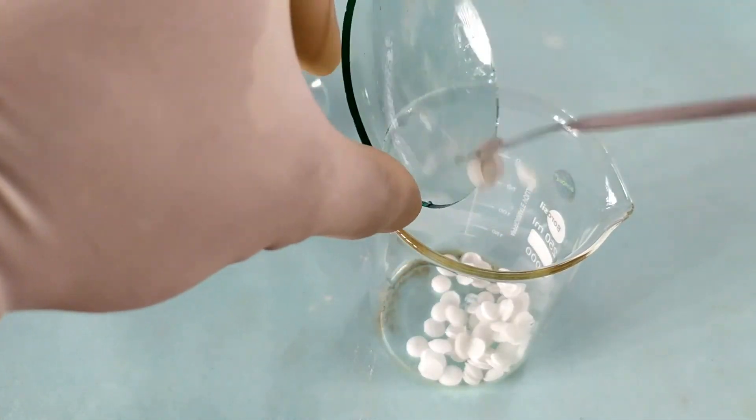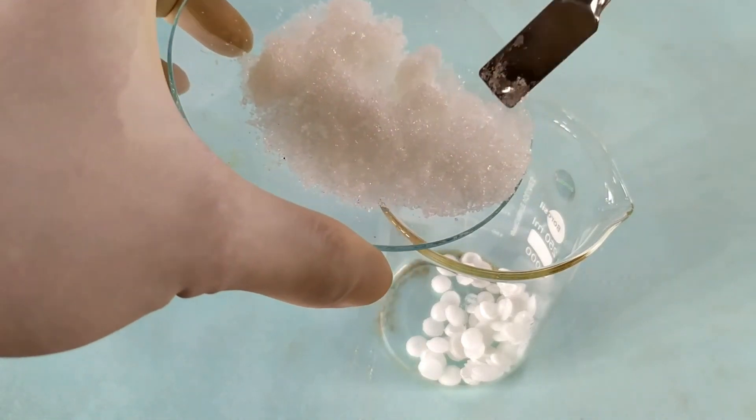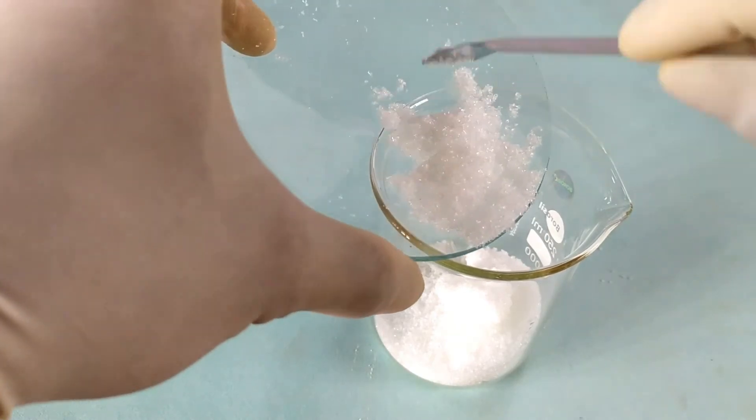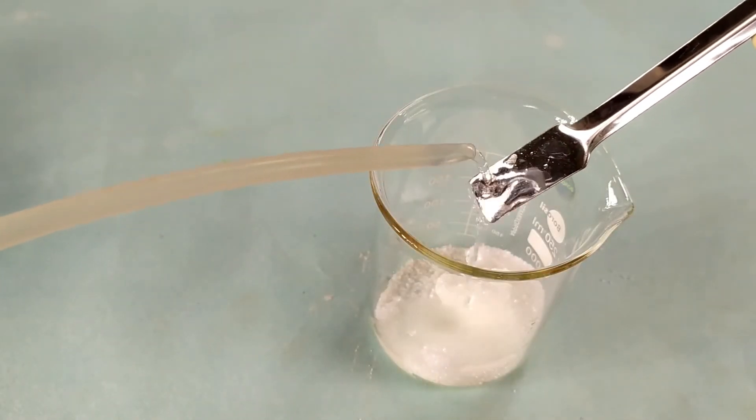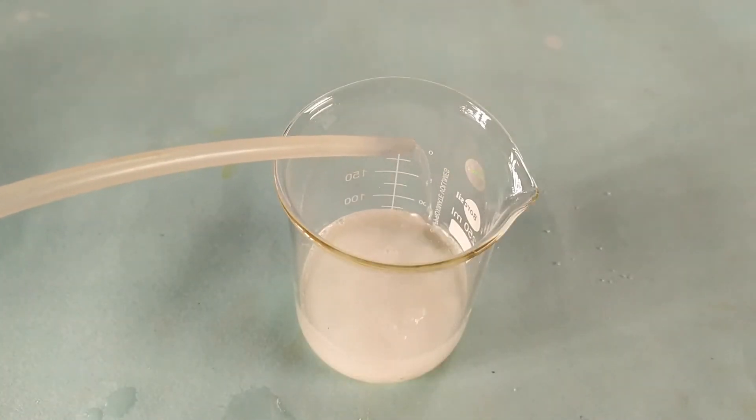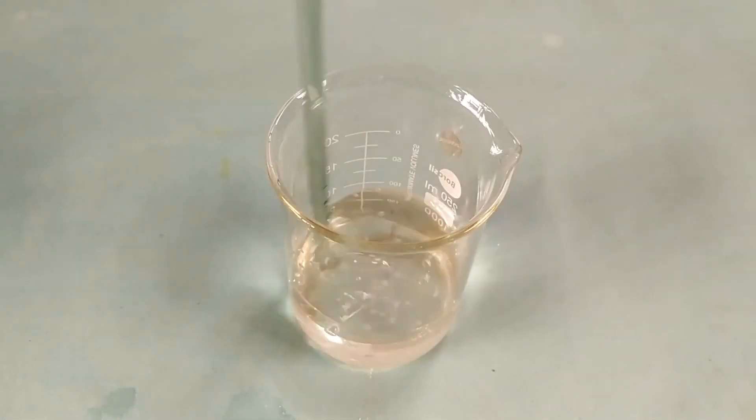To prepare reagent-B, weigh 35 g of potassium-sodium tartrate and 12 g of sodium hydroxide in separate watch glasses using an analytical balance. Transfer the two salts into a beaker and rinse the spatula using a small amount of distilled water. Add about 40-50 ml of distilled water into the beaker and stir the contents until the two salts dissolve completely.